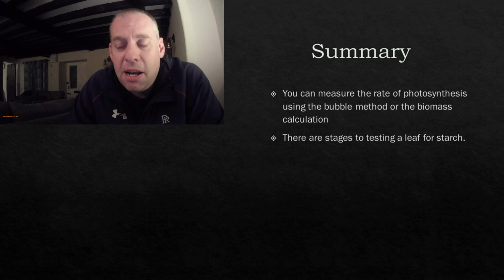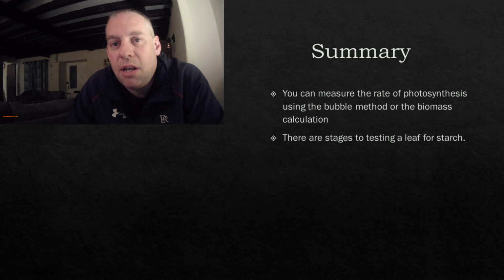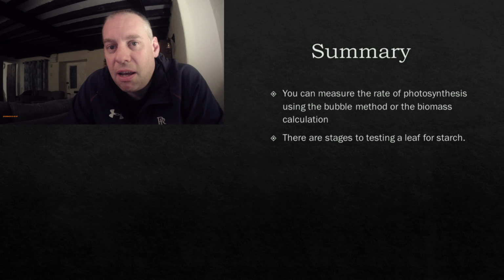Also, and it's a really common question, they ask you to describe the stages for testing a leaf for starch. You need to be able to name all of the stages, describe what's happening, explain why, and give safety precautions.